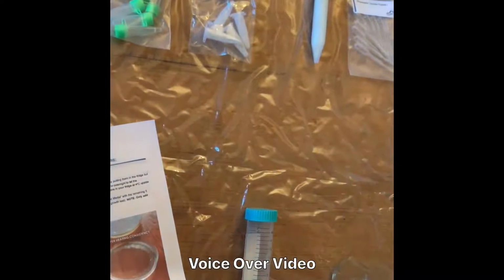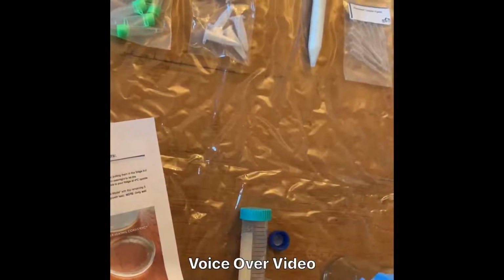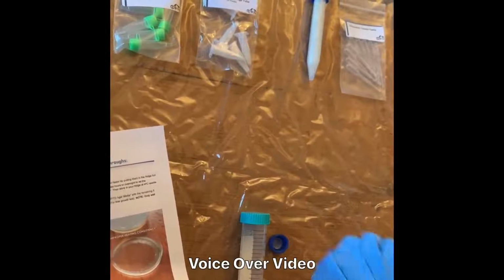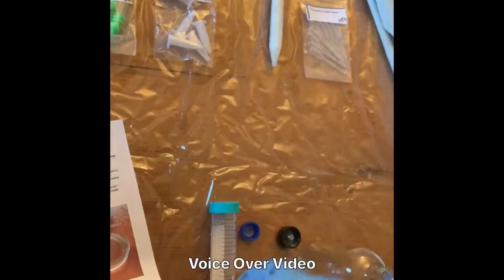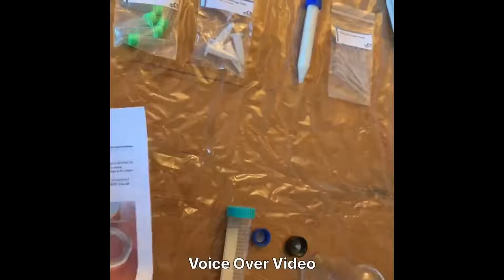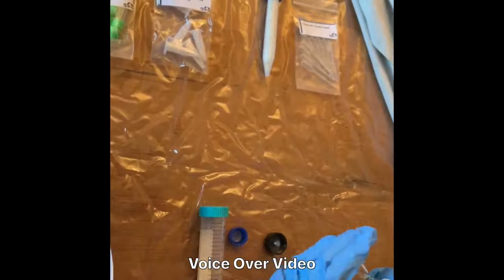It's just a difference with the water, how much water you add. I'm pouring that into the glass bottle and adding water and repeating the whole process and pouring it into 2 plates. I did mark the plates so I know which ones are which.